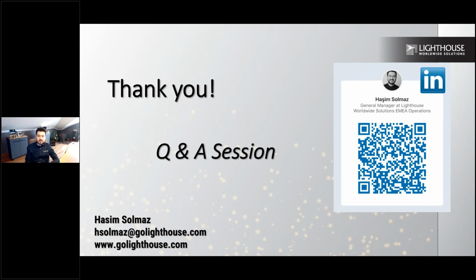For requalification, the classification period should reflect this kind of critical application. The classification will be for particle counter purposes, the cabinets every 6 months, critical zones, even if it's grade B or ISO class 6, still 6 months. You can make it up to 12, depending on your trending.